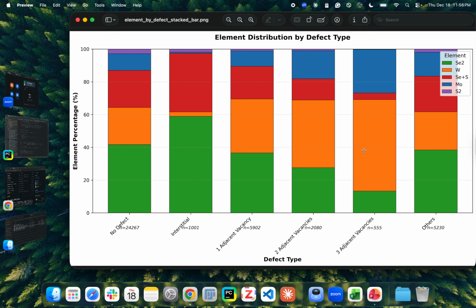This is in line with the intuition that we have about the material, and this type of analysis takes only about 10 to 20 seconds other than element identification, and with element identification it takes about 2 minutes per image.